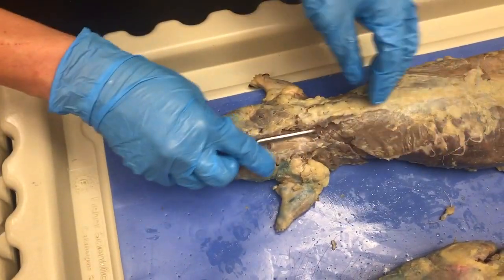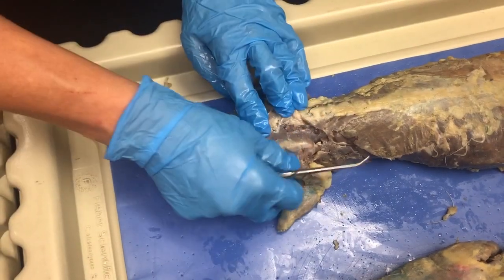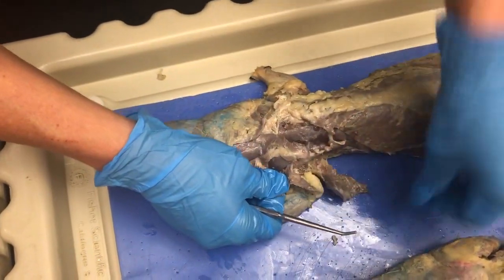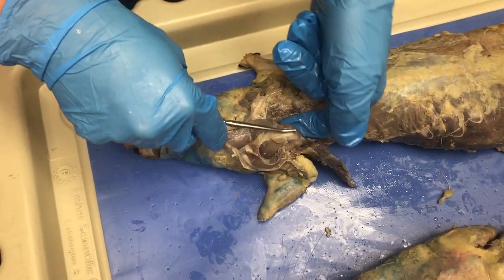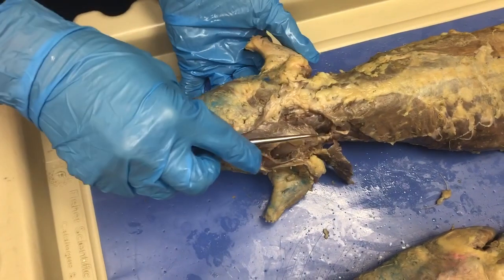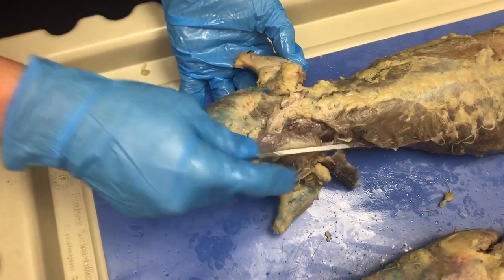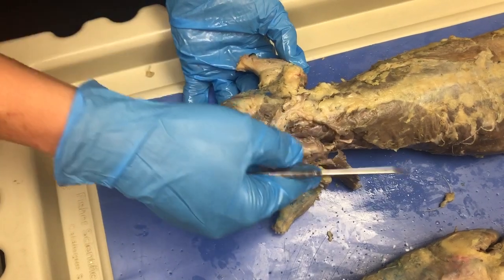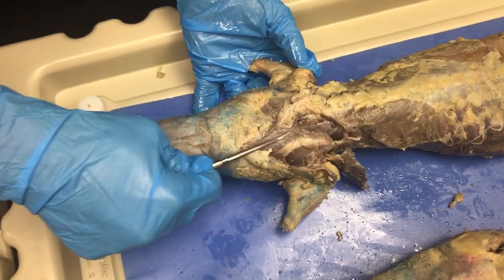If you transect through the trapezius muscles and go deeper, you'll get the chance to see the muscles that are attached to the scapula to the vertebral column. You notice this got cut. So being connected right here would be the rhomboid major, and then you have the one close to the head which is the rhomboid minor.